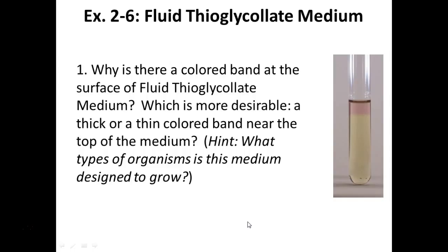The colored band indicates where oxygen is. A thin colored band near the top of the media is more desirable — we just want a small amount of oxygen. If it diffuses too far we won't have an anaerobic zone at the bottom. Our uninoculated tube had a thick layer because the media was made the day before. Tubes in the refrigerator that are completely pink can't be used as-is, so we boil them for five minutes to drive all the oxygen out, then cool them and let oxygen slowly come back in before inoculating.